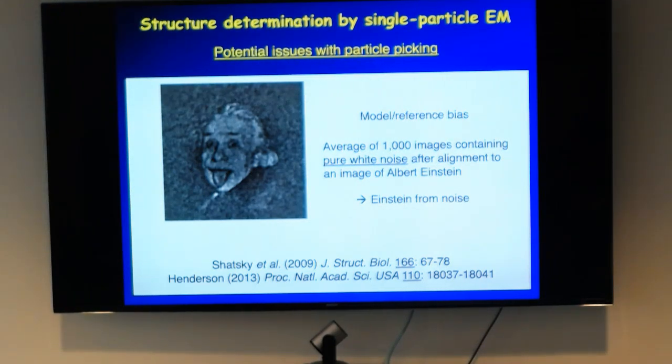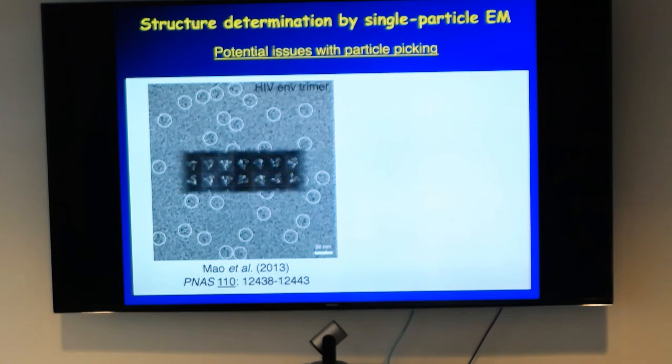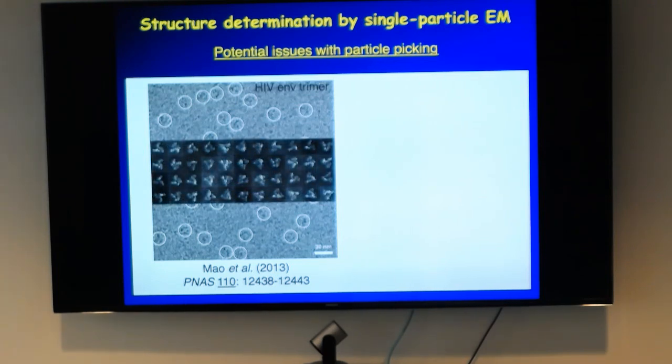So that actually used to be a real problem, because this is a paper that was finally published at about 8 angstrom. But in the beginning, this group wanted to publish a structure at 1.9 angstrom or 1.8 angstrom with an F20. It was actually fine. So in any case, this was what the images looked like, and then they got these amazing averages where you saw all these details. And then they got 8 angstrom out of it. And that created a big, so everybody's laughing. This had a big stir in the field, and a lot of us tried to explain to these people why they shouldn't do that, but they wouldn't listen.